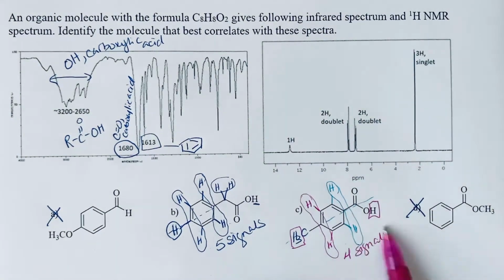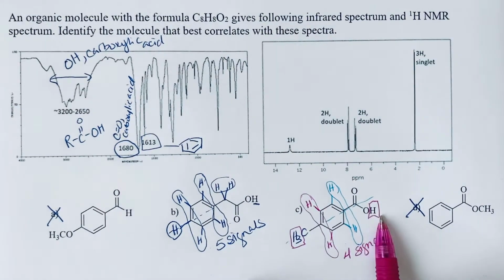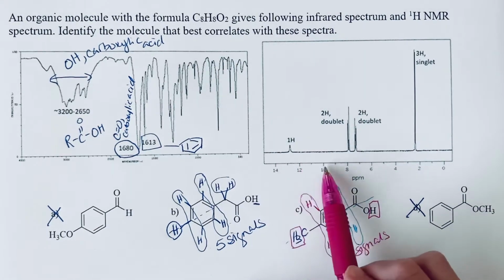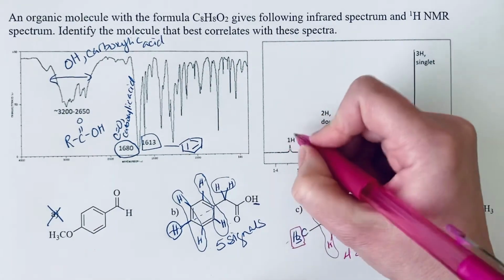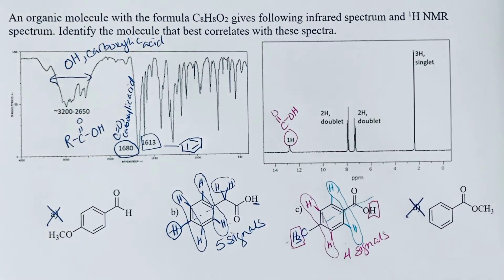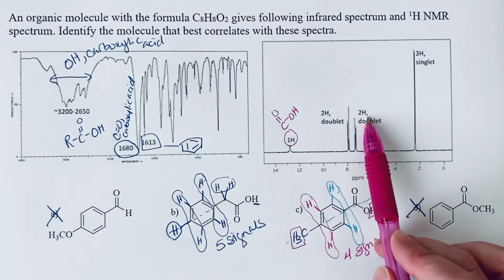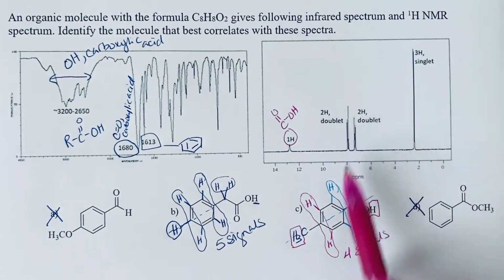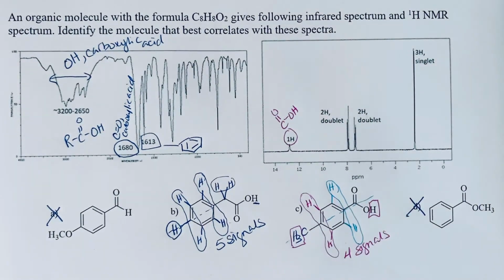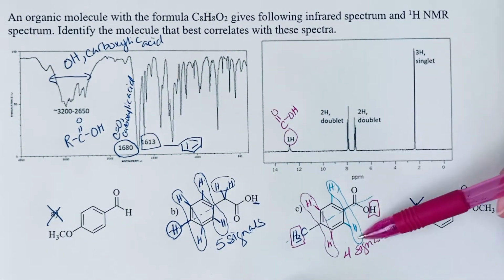And so let's make sure that it does completely match. The carboxylic acid protons should be very distinct. They usually show up between 10 and 13 or so. And so here we see that. That's the carboxylic acid proton. And then we see in the aromatic region a total of 4 hydrogens, 2 hydrogens plus 2 hydrogens, and that's how many aromatic hydrogens we have. And 2 signals in this aromatic region, these ones and these ones.